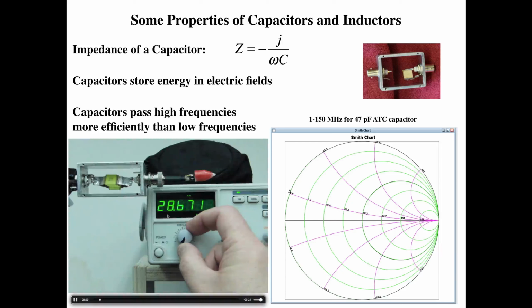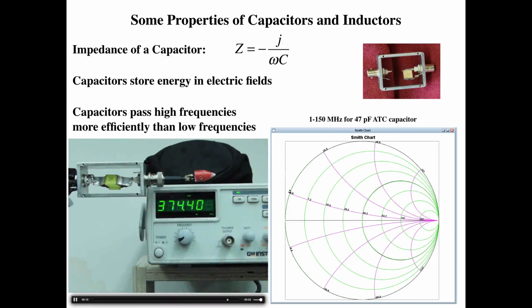So increase the frequency starting at 28 kilohertz. Notice the light is off. And keep increasing the frequency, and eventually the light comes on, and there it is. It's coming on. And keep ramping up the frequency. Now we're up to about 2 megahertz, and the light is still on. So now we'll start dropping the frequency. The light's on, keep dropping it, and then you see the light goes off. So the light bulb is on at high frequency and off at low frequency.